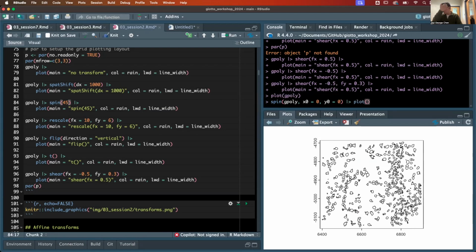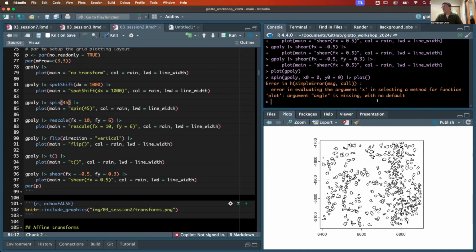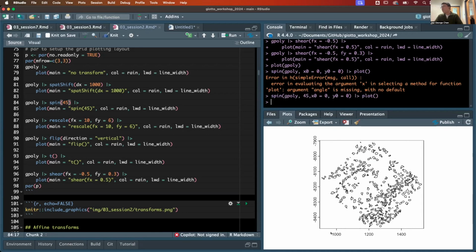In general, I think most of the things, if it's related to how to set up a data set that you're seeing from one of the spatial platforms that they've exported, you're usually going to want to set these transforms from x0. So that's just something to watch out for. Oh, spin, yeah. The angle itself I need to set. So 45. Just do note that depending on how you set your x0 and y0, the actual end values for your x and y can be very different.